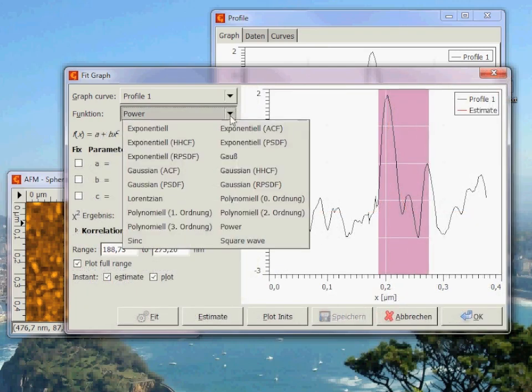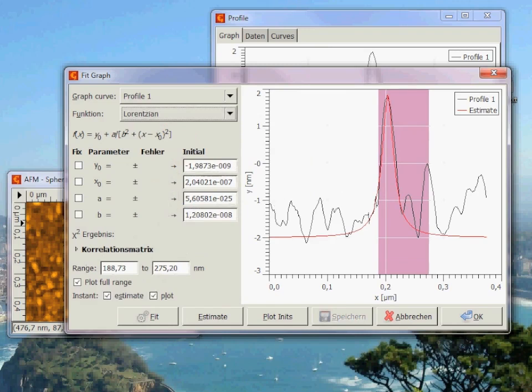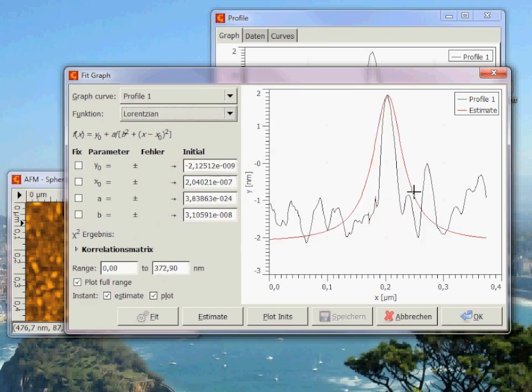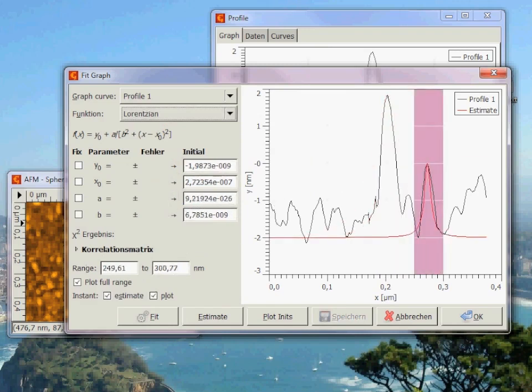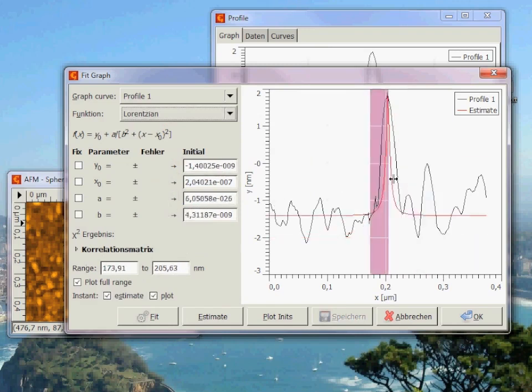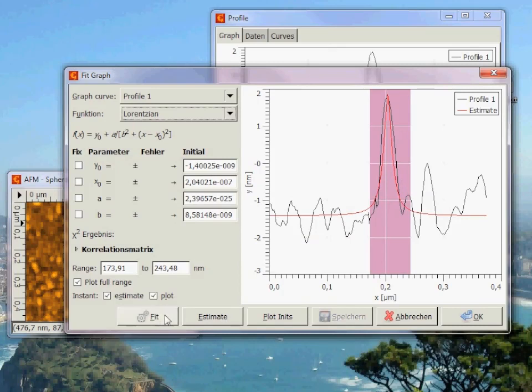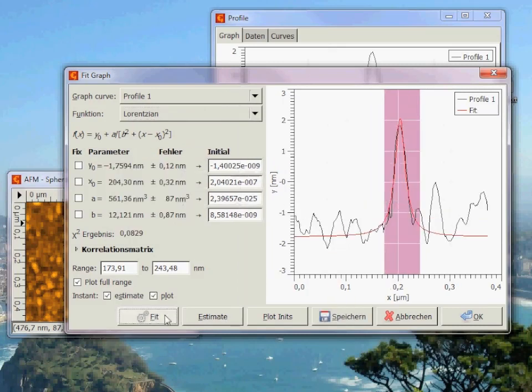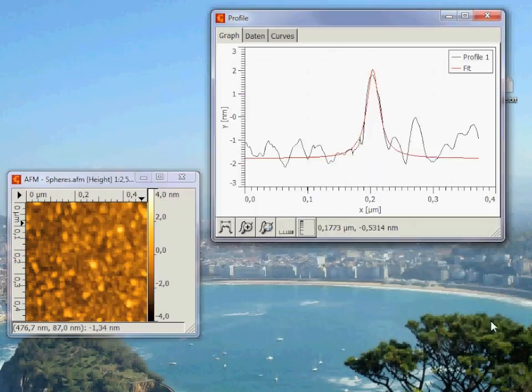Or for example, a Lorentzian. Apply this to have the fitted function in your profile.